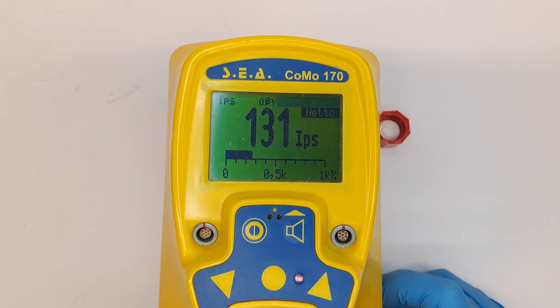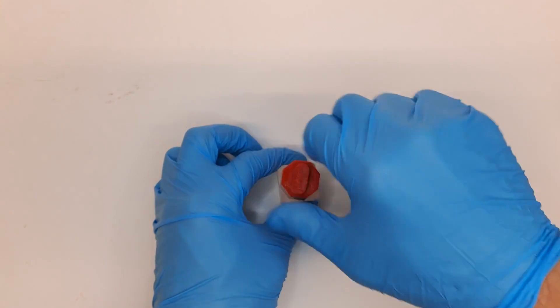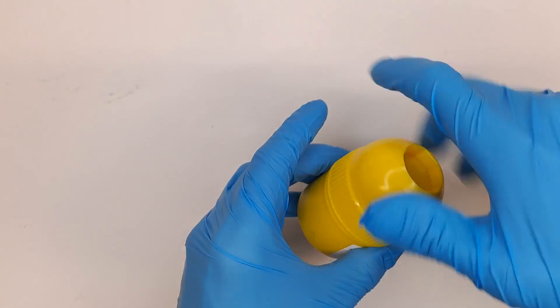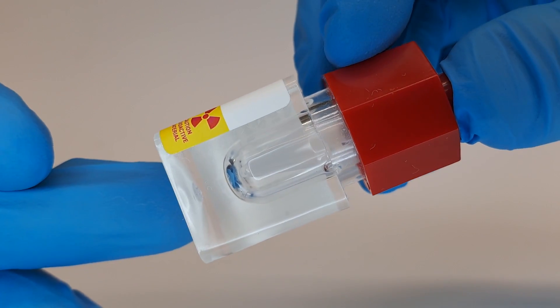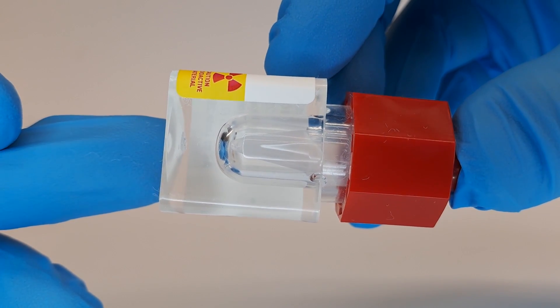Multiply that by 10 and it's 900 days, approximately three years. After this time, the solution is considered decayed and can no longer be used for experiments. This makes the disposal much easier. Pack it up and wait.